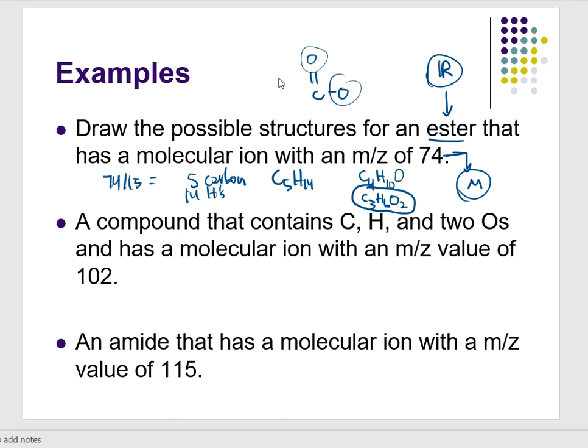Again, that's the power of the mass spec. And when you couple that with an infrared, everything that you need to know about the molecules is at the source of your fingertips with just a bunch of lines and squiggles. Kind of amazing when you sit back and think about it. Let's look at a second one.